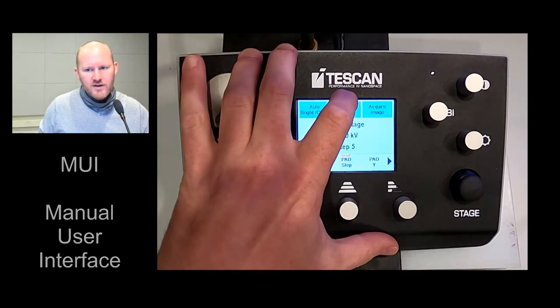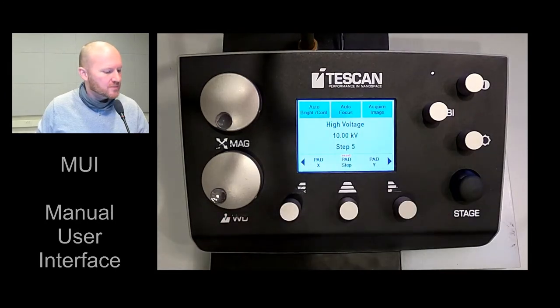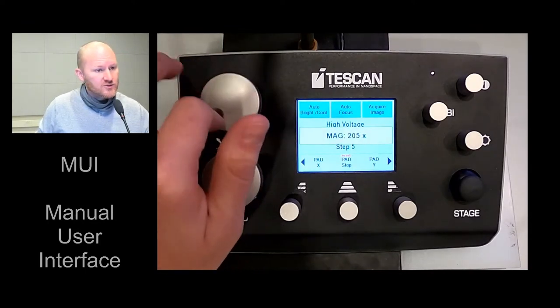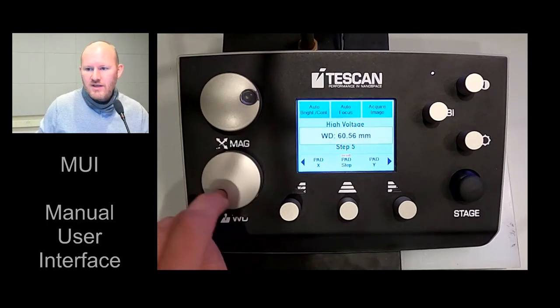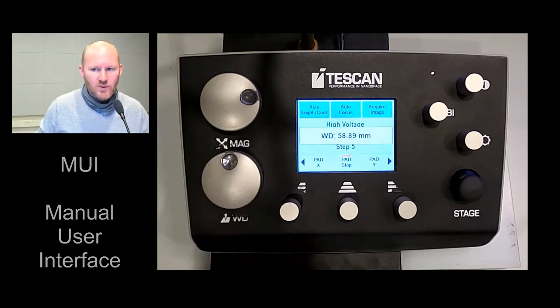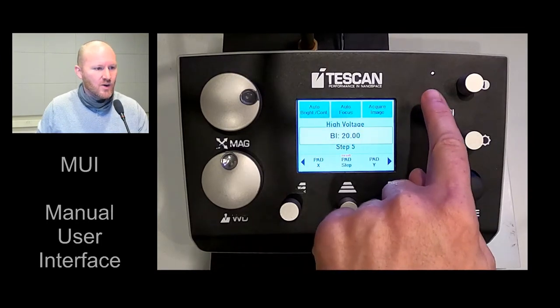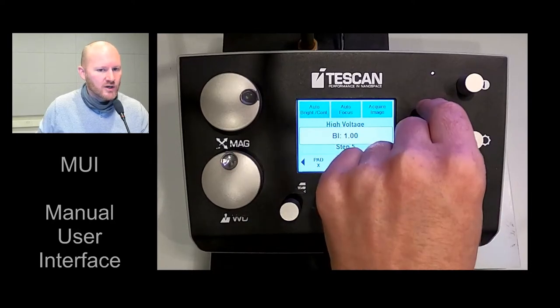The auto focus button — honestly, is one that I never use. I do also use the acquire image button. Also on the MUI, we have our magnification knob so we can zoom in and out. We have a working distance knob — working distance is focus. Again, beam intensity: as I go up, I'm getting a higher current; as I go down, I get a lower current.